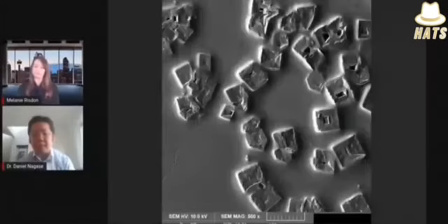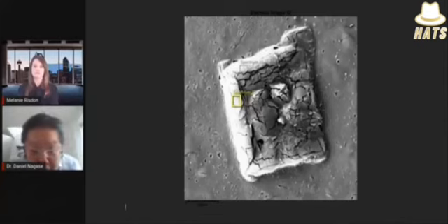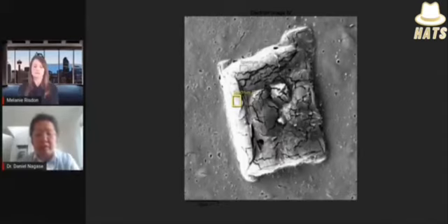But before we go on, I just wanted to show a couple of files of the Pfizer, to show that there are strange structures growing in the Pfizer samples as well. So if we could pull up the Pfizer files. This is what we saw in the Pfizer sample, and in a droplet of the Pfizer, you'd see literally thousands of these little squares. So we put it under the electron microscope, and we took 2 samples to examine what elements are in spectrum 36 and spectrum 37. Let's scroll down and find out what elements were there.